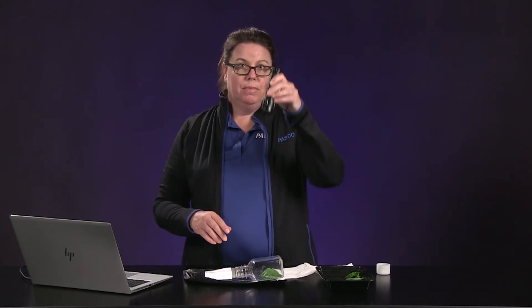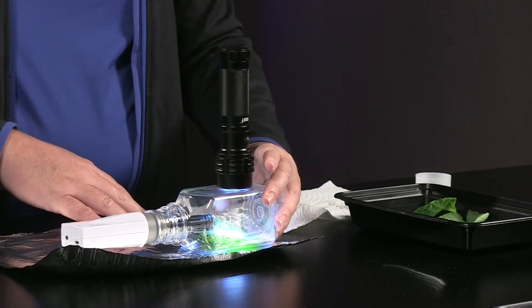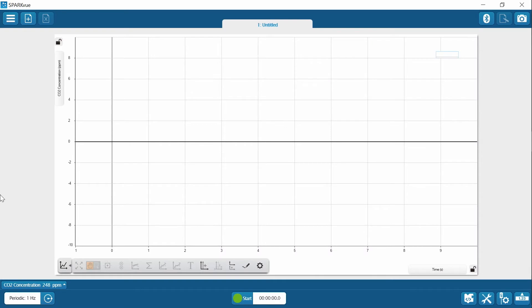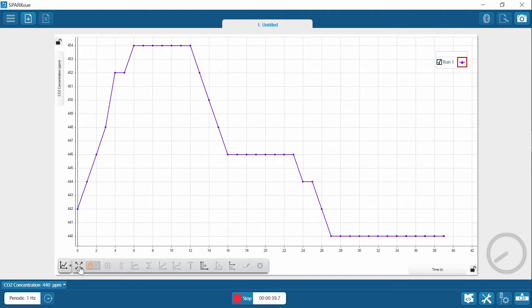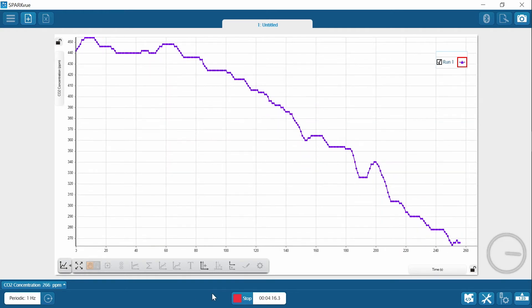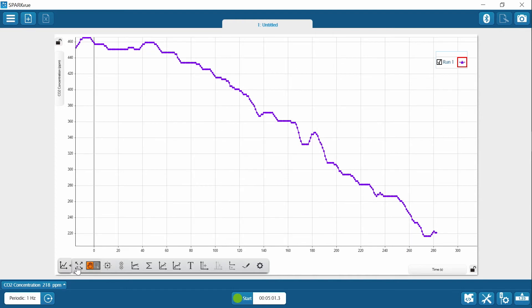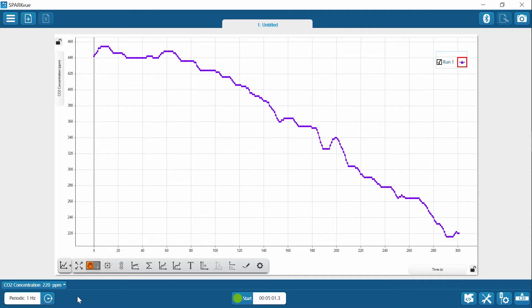Place your light directly over the spinach leaf — this is your setup. Start collecting data; we need to collect data for five minutes. After five minutes, stop collecting data and scale the graph if necessary by clicking the cross bars. You're going to want to sketch this data into graph one — label both axes and include units and a scale. Identify the data run as light in the key.